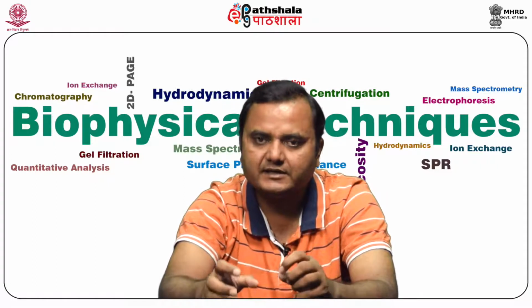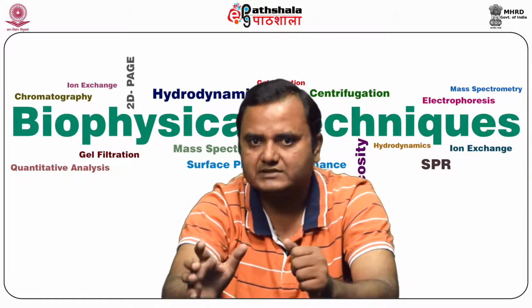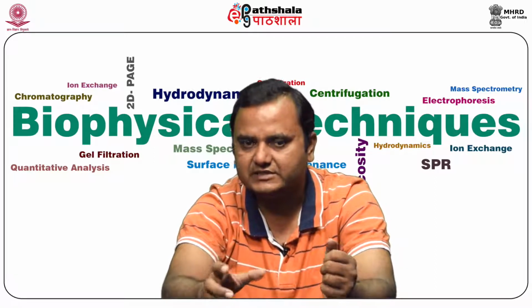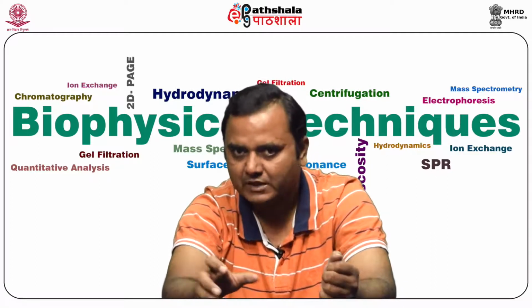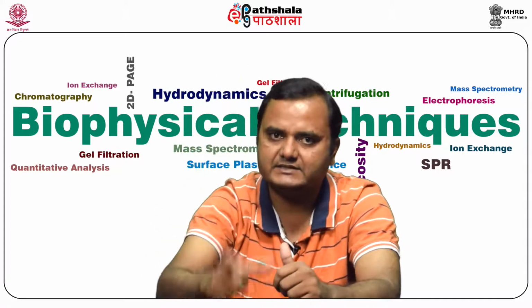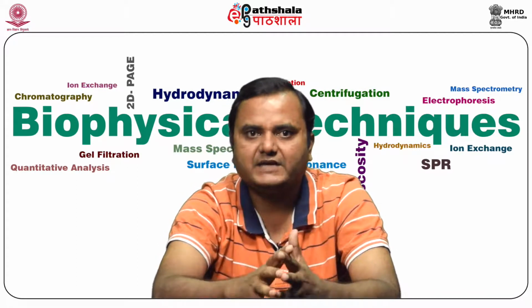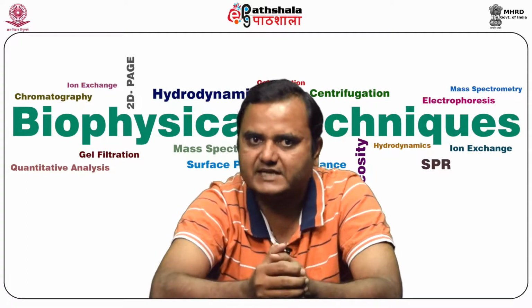This means that under centrifugal force, particles will move through the medium and density gradient and stop at a point where the density of the particle is equal to the density of the surrounding medium. The purpose is to separate molecules based on density by creating a particular density gradient. There are different types of medium used to create the density gradient, depending upon the desired outcome.